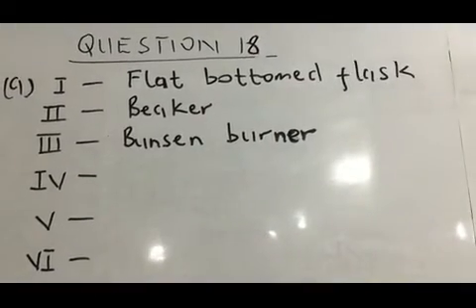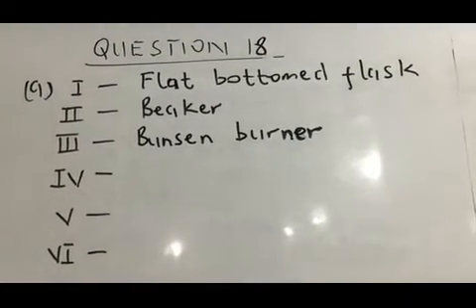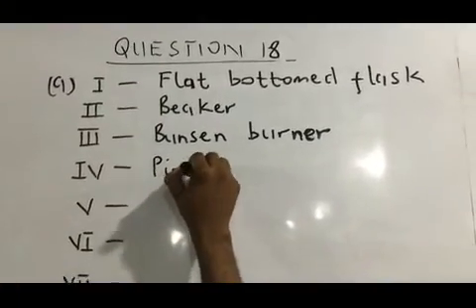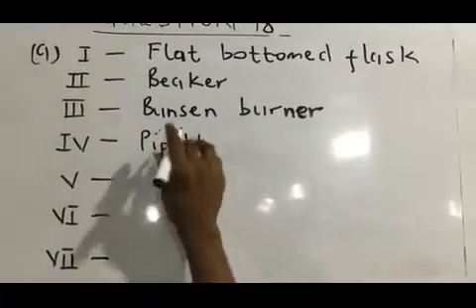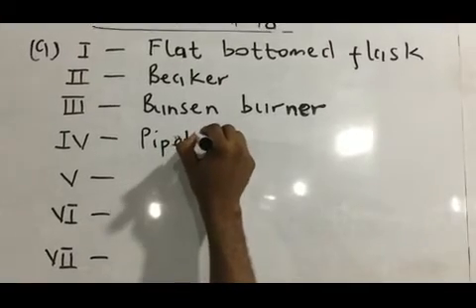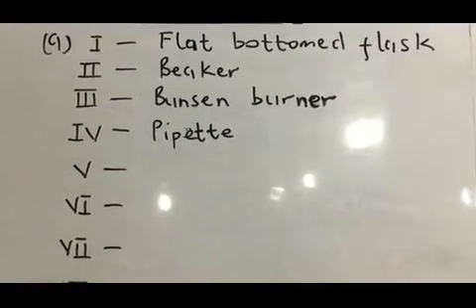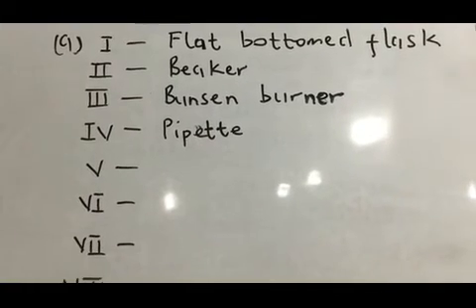Your IV is pipette. Take note of the spellings. The spellings are important.